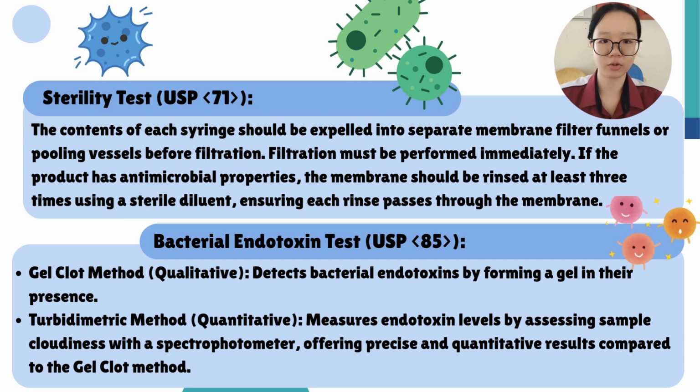If the product has antimicrobial properties, the membrane filter should be rinsed at least 3 times using the sterile diluent. Make sure that each rinse passes completely through the membrane to remove any potential microbial residues that could interfere with the microbial detection. Next is the bacterial endotoxin test.